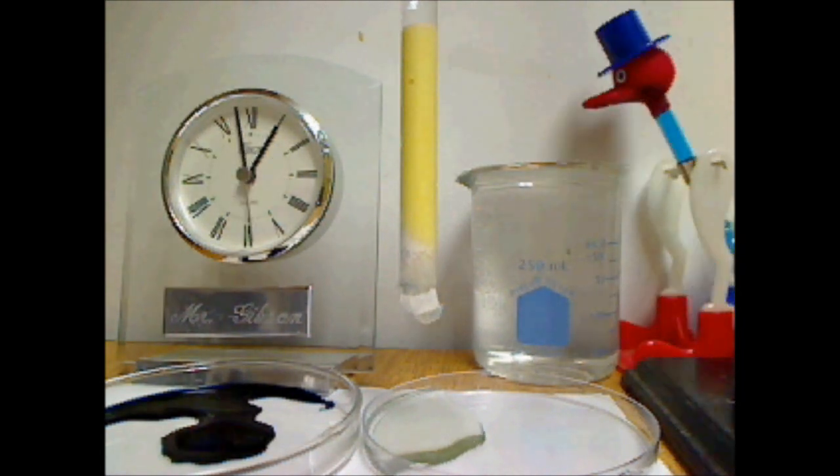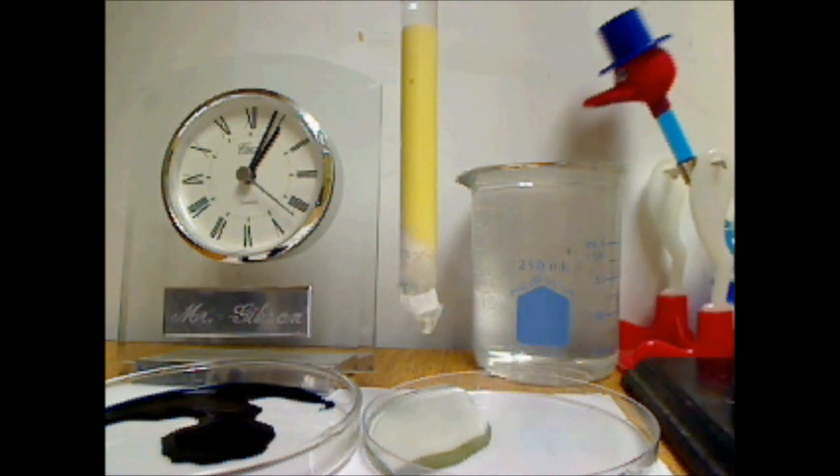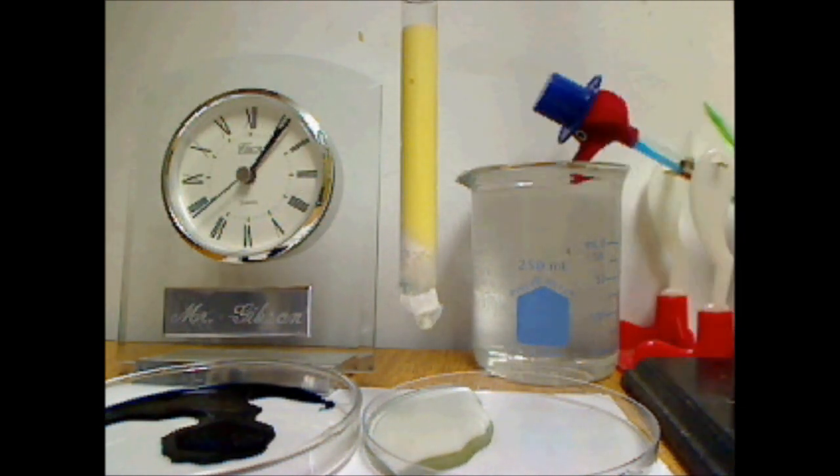So what you can do with column chromatography is change the mobile phase, and then it will hopefully flush it out. So I'm now going to change the mobile phase to acetone.